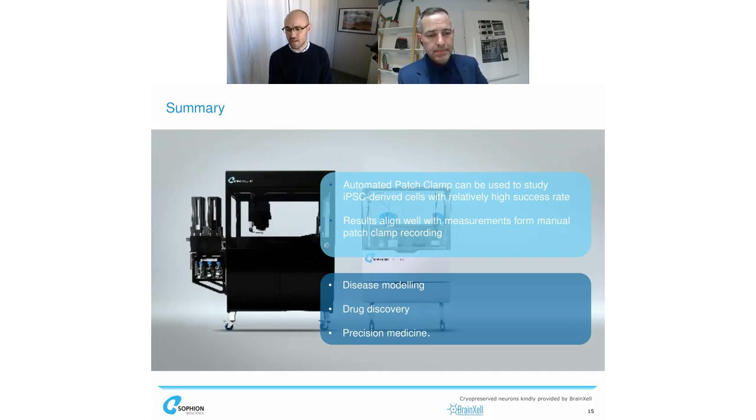That's absolutely a good point as well. I mean, of course, if you have a different driving force, you could imagine, although this was normalized, so it was a normalized current, G over G max, but certainly the composition of the solution always is the first point to look at. And I think there are different approaches to look into.